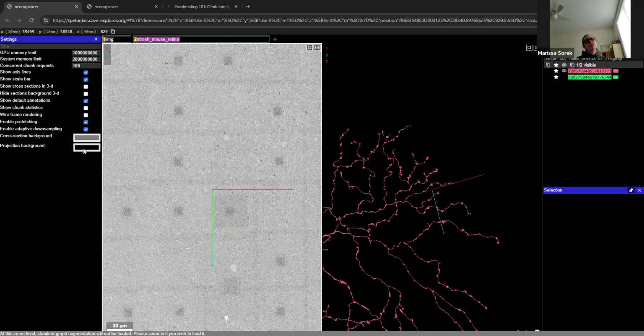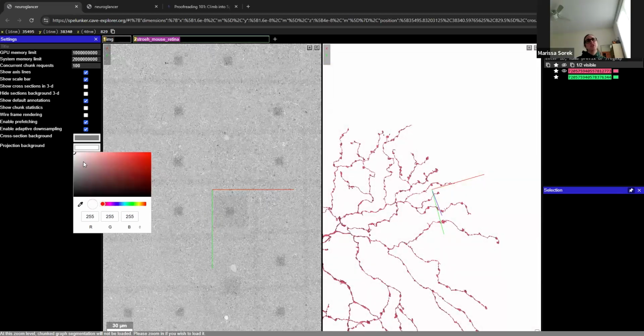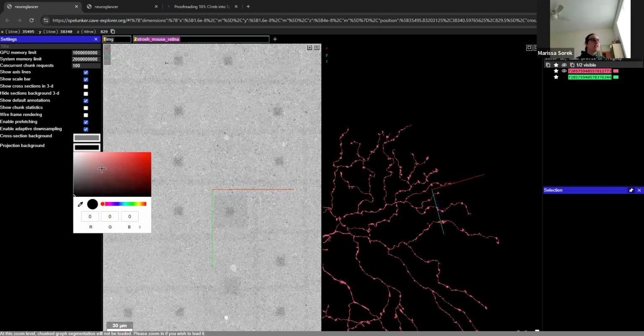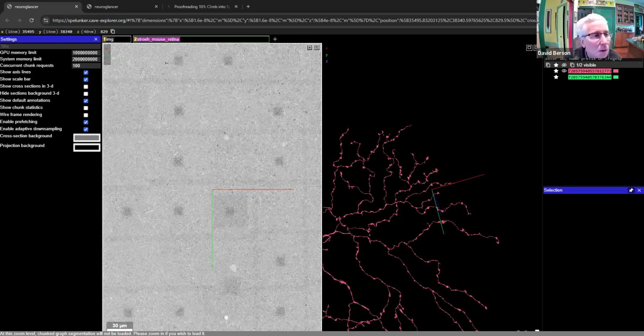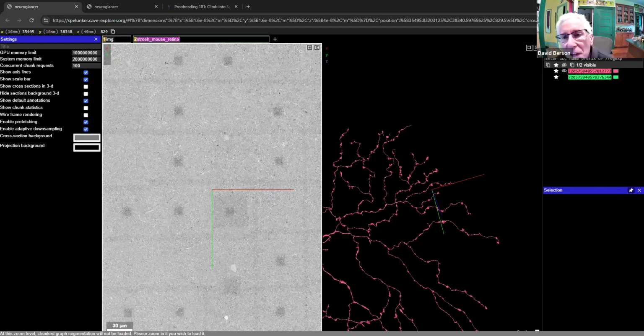And also I'll mention this too, just because we have this little settings menu up, if you do want to take a particular image or picture, you can change the background color, or if you find that black is a little tough for you on something, that is possible. I do mention that for screenshot purposes. And with that, we actually have a little screenshot button right here. So that'll automatically take one and download it for you. It's up at the top here, in the right corner, next to our help menu.